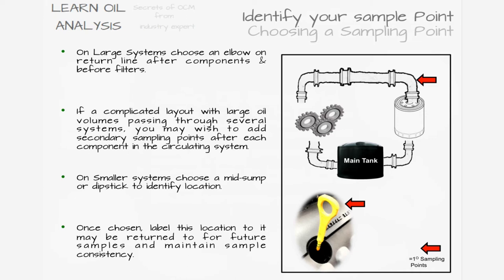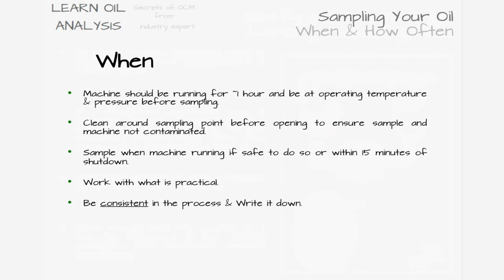Sample when the machine is as close to operating conditions as possible. Clean around the sampling point and run off some oil prior to sampling to ensure the sample is clean. You may also want to wipe the pump surface that will contact the bottle with a lint-free cloth if there is any visible oil around the threaded area, usually because the oil bottle was overfilled on a previous sample.